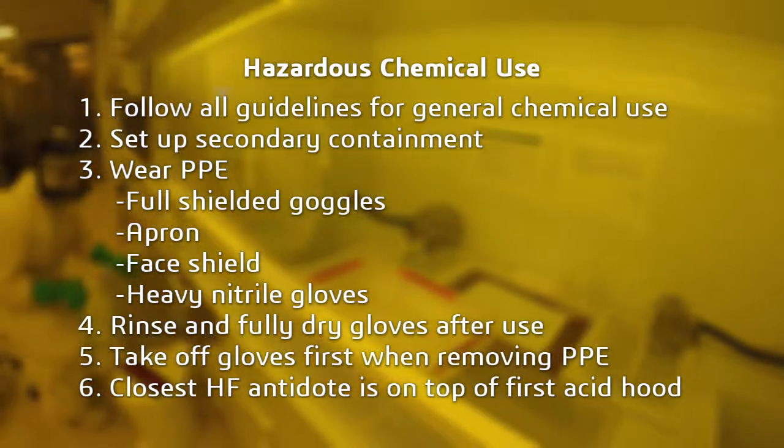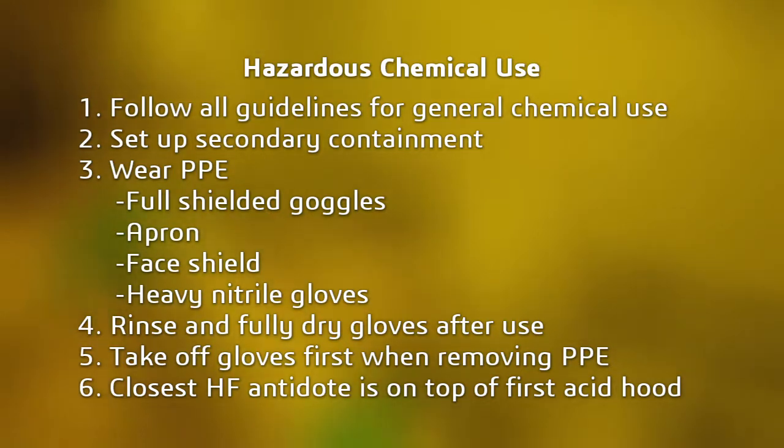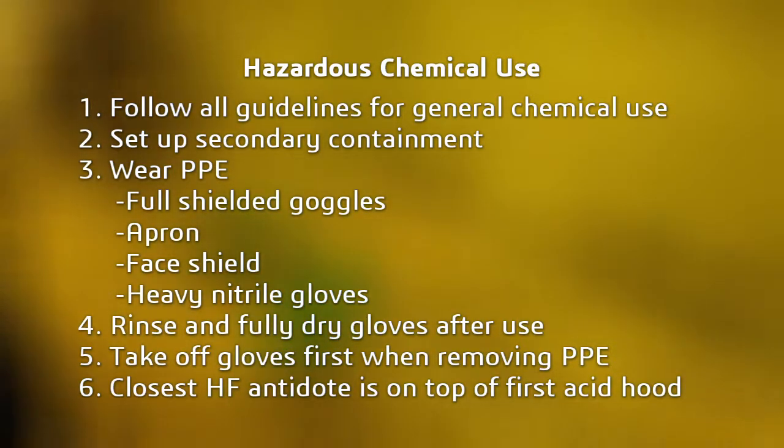When using hazardous chemicals, follow all guidelines and hazard control plans. Check whether additional containment is required and wear the appropriate PPE. After your experiment, store PPE correctly, thoroughly rinsing and fully drying.